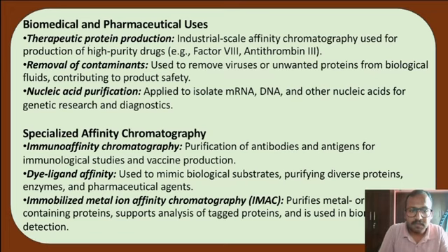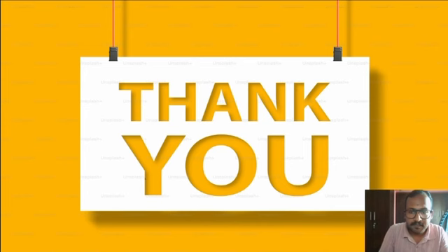Specialized affinity chromatography: immunoaffinity chromatography, which involves purification of antibodies and antigens for immunological studies. Dye-ligand affinity, used to mimic biological substrates, purifying diverse proteins, enzymes, and pharmaceutical agents. It is also used in immobilized metal ion affinity chromatography, which purifies proteins that contain histidine.